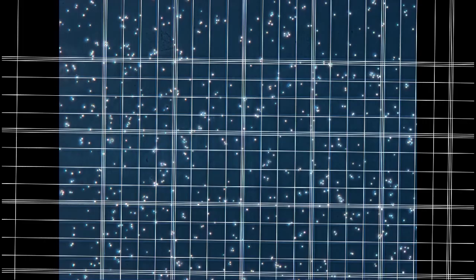The grid allows you to count the amount of cells in a defined volume and therefore to determine the concentration of the cells in suspension. The grid consists of several large squares. The square in the middle is used for cell count. Various types of hemocytometers exist. The most popular ones are Neubauer-Automa chambers.